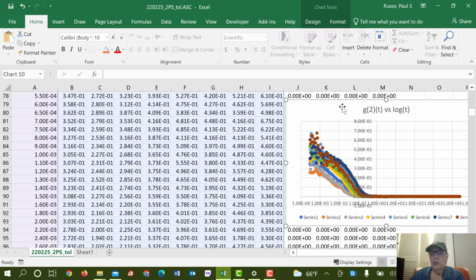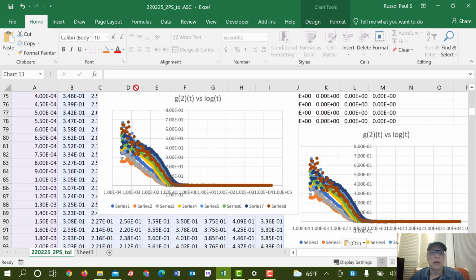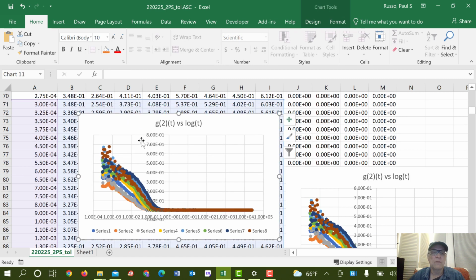Remember in the infamous tutorial review, chapter 12 that I always refer to, we talk about 4 plots: ln, log, ln, log, and log, ln, I guess. We'll generate those, but I want to trim this a little bit further first. Let's actually keep that for right now and copy it and make another version of it there.